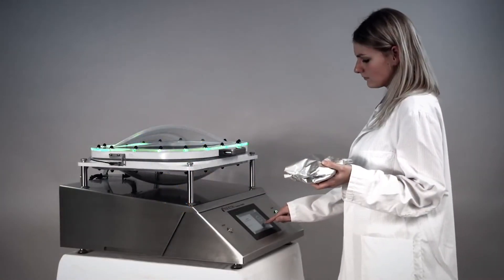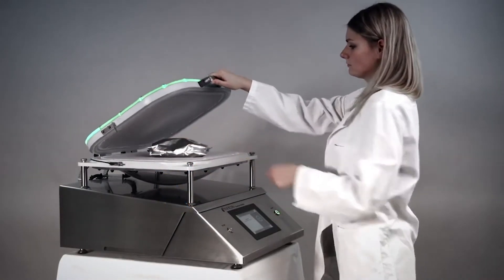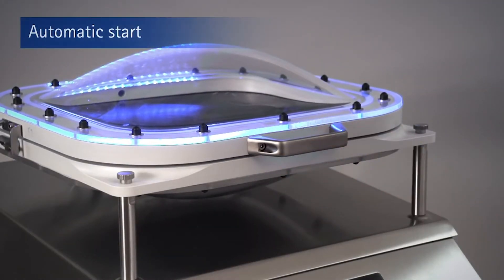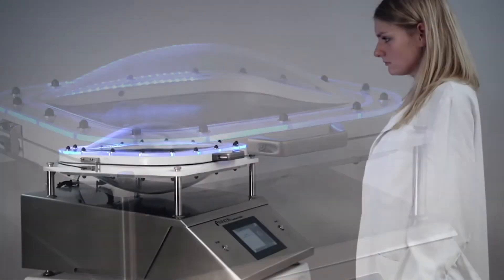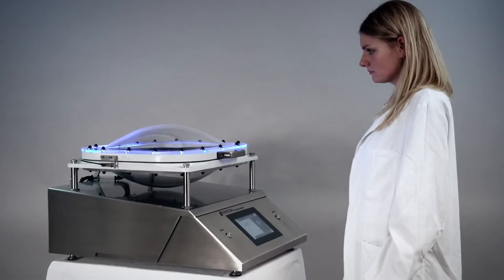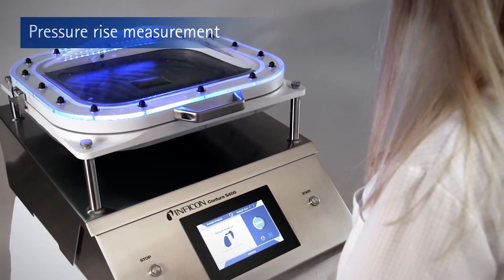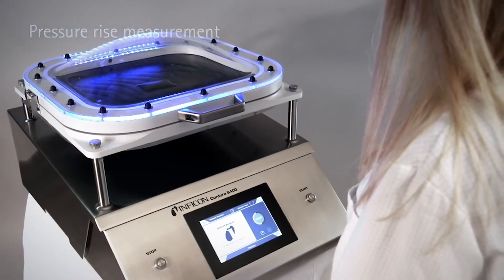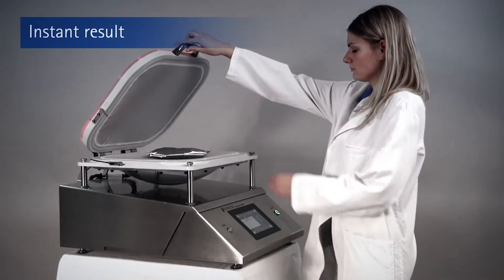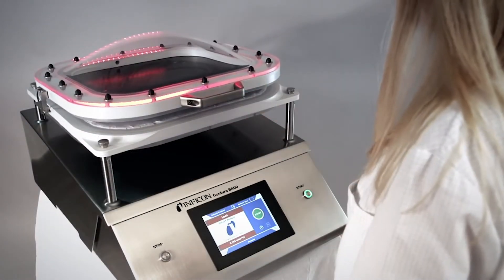When the package is inserted in the foil chamber and the lid is closed, the Contour S400 automatically starts detecting for leaks. When the vacuum is generated in the film chamber, the two flexible membranes tightly and safely enclose the test object. The subsequent measurement of the pressure increase reliably detects both the tiniest mini leaks as well as gross leaks. After a few seconds, the Contour S400 shows the results on the touchscreen as well as with the color signal on the display.